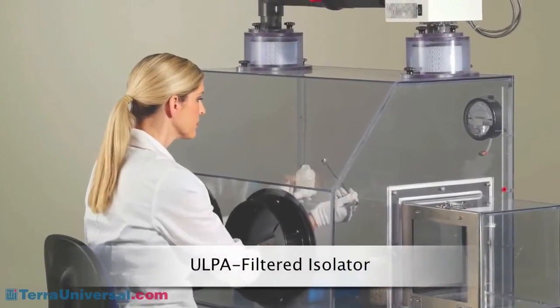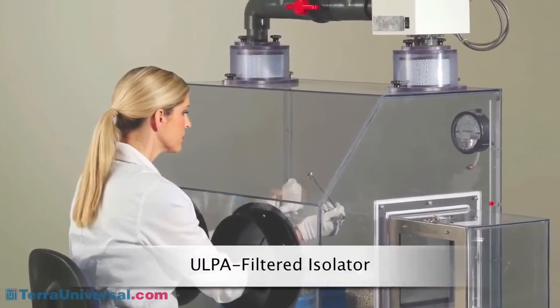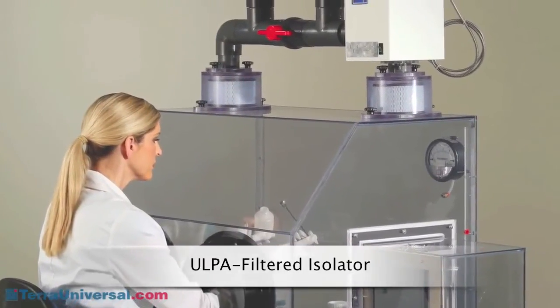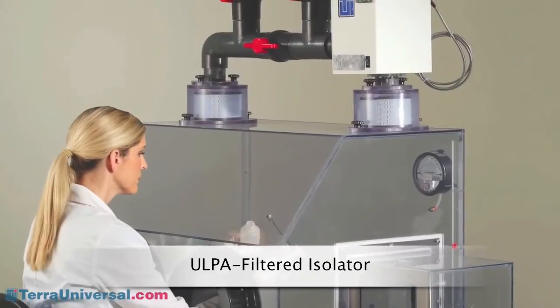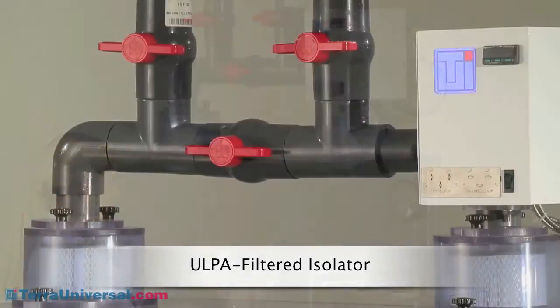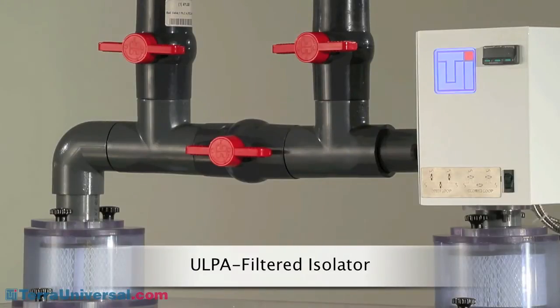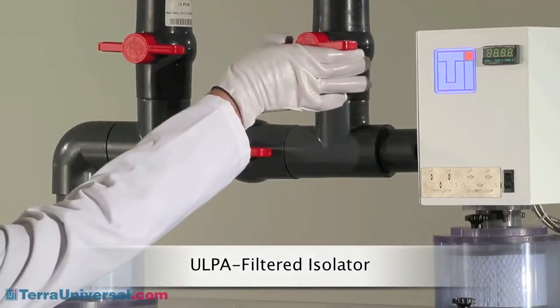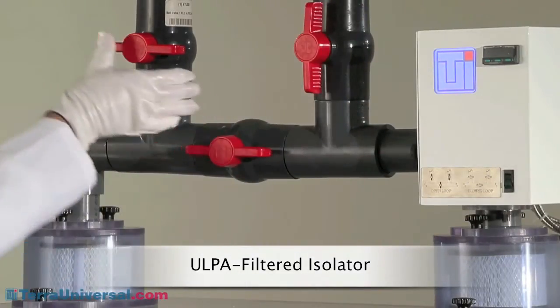Tera offers several contamination control modules. The isolator you see here features a versatile recirculating ULPA filtration module that continuously scrubs air clean of submicron particles. This system can be easily configured for closed-loop or open-loop operation by adjusting a pair of valves in the air line. The fan module houses a clean, brushless DC motor.